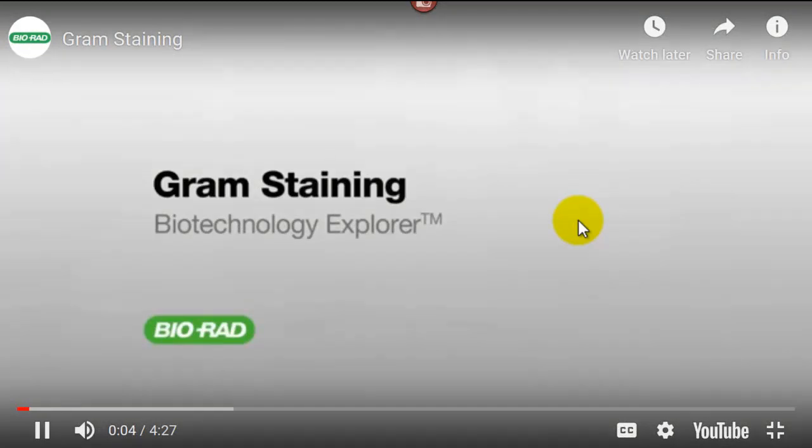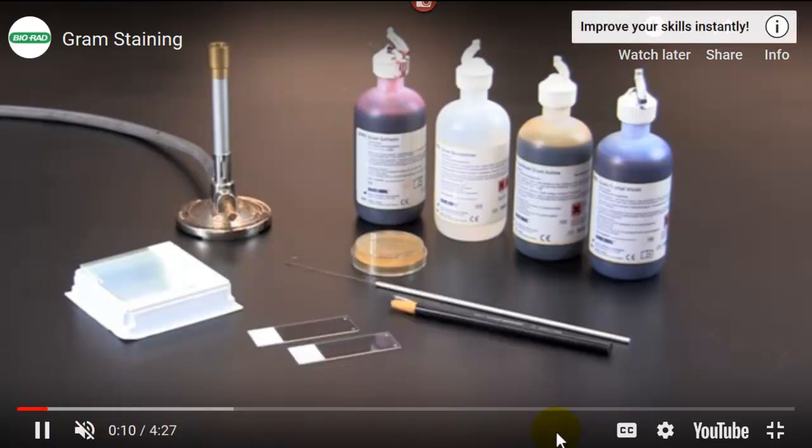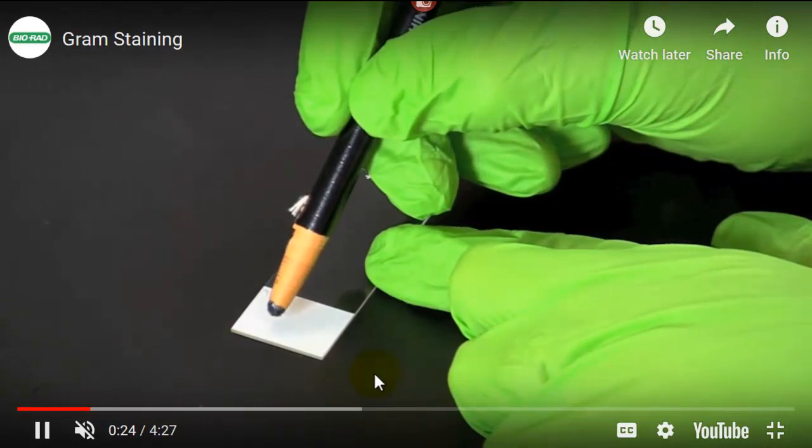We're going to talk about a gram stain now. Now, Bio-Rad's a pretty reliable company. In this video, you will learn how to perform a gram stain. And it looks like they got them all lined up here. This is definitely acetone. That's safranin, and this is iodine, and that's crystal violet. And then you have some blank slides. You have a cultured disc there, and he went pretty quickly.